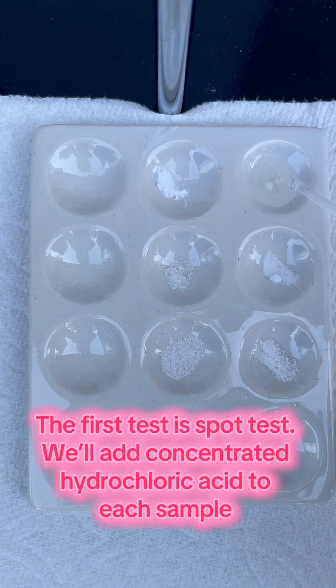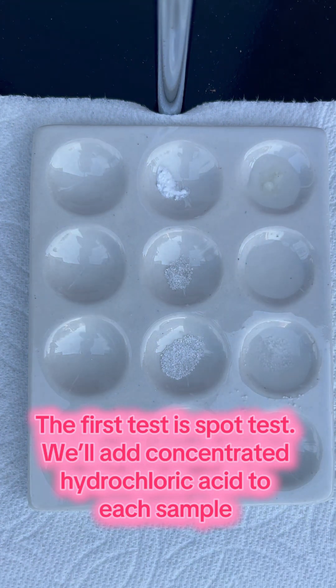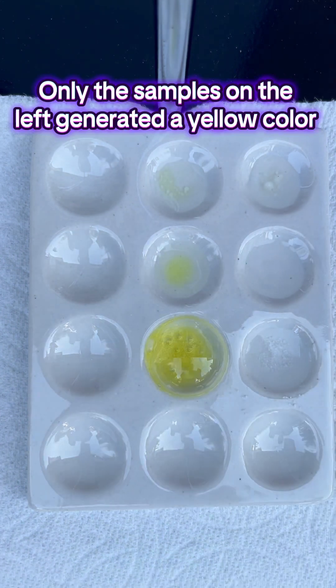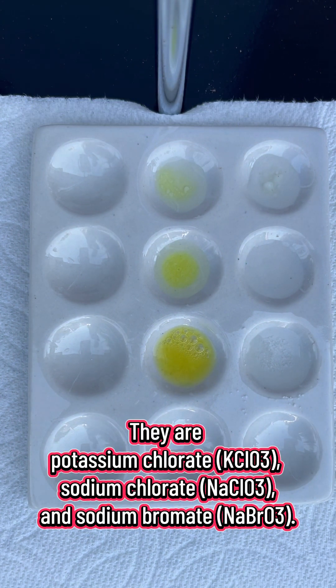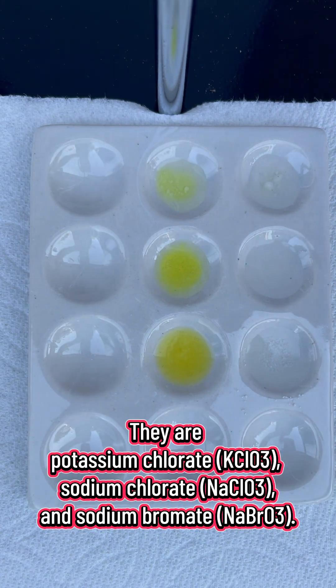The first test is the spot test. We'll add concentrated hydrochloric acid to each sample. Watch carefully what will happen. Only the samples on the left generated a yellow color. They are potassium chlorate KClO3, sodium chlorate NaClO3, and sodium bromate NaBrO3.